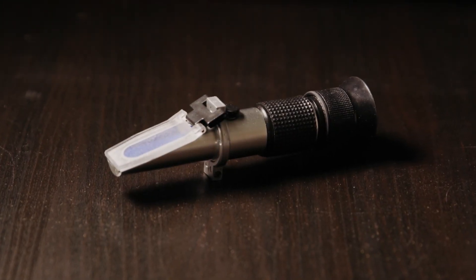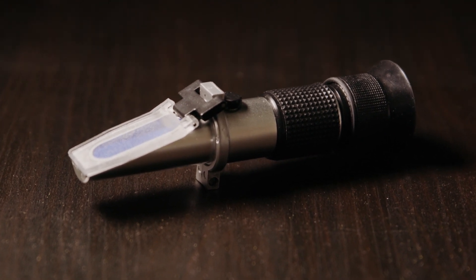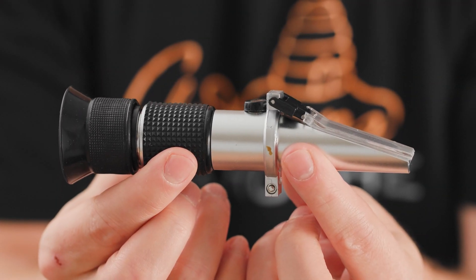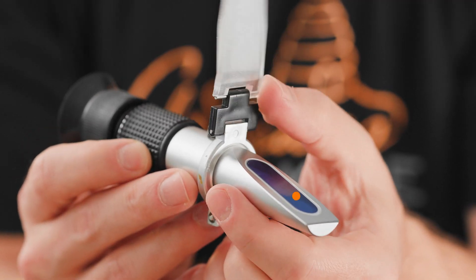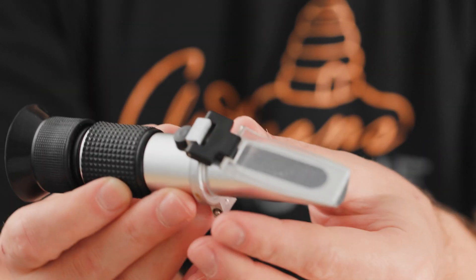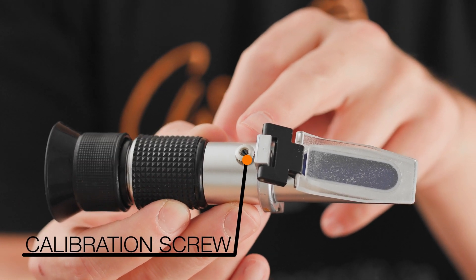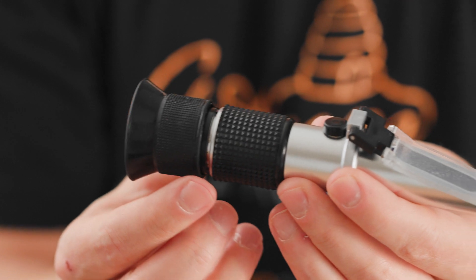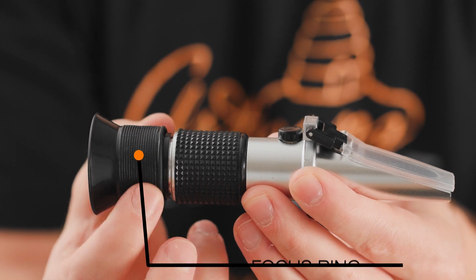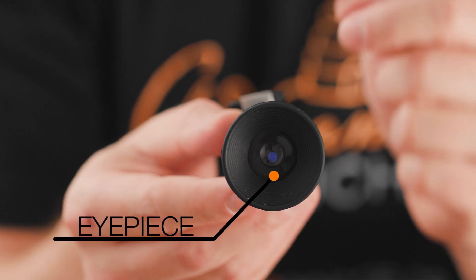To measure the water content of your honey, you will need a well-calibrated refractometer. Here are the four main parts: at the front, we have the prism, where honey will be placed to measure its water content. Behind, there is a small calibration screw to calibrate the device. At the end, we have the focus ring, which you can turn to focus on the scale. And at the back is the eyepiece, where you look to take your measurement.